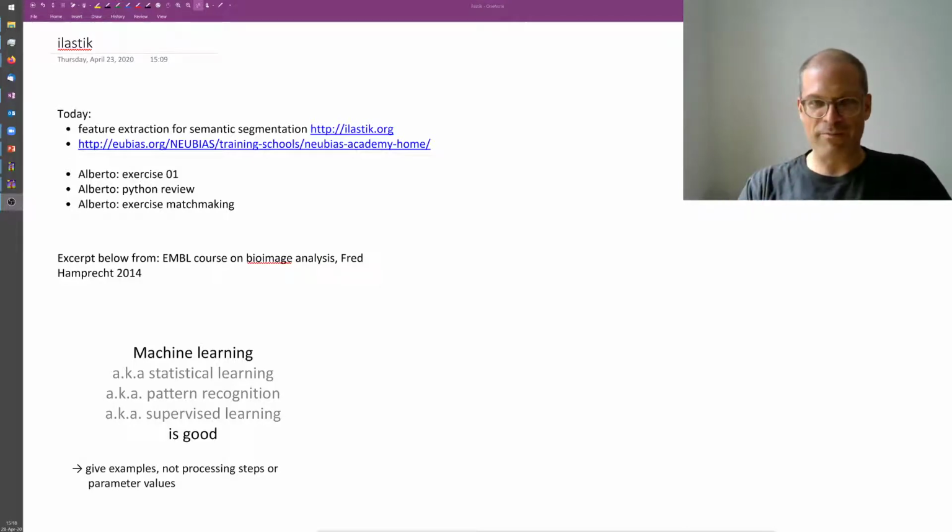My lab, we're in particular working a lot with biological images or biomedical images. Now, I want to show you a few slides, and I've also copied them into the presentation.